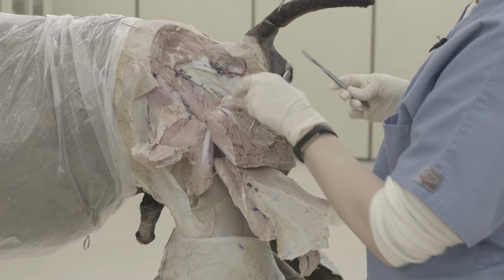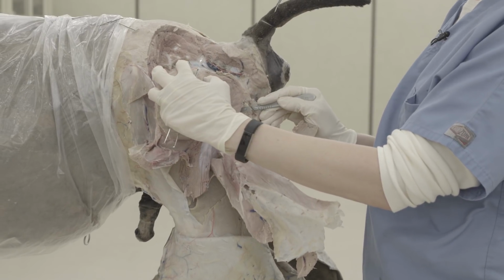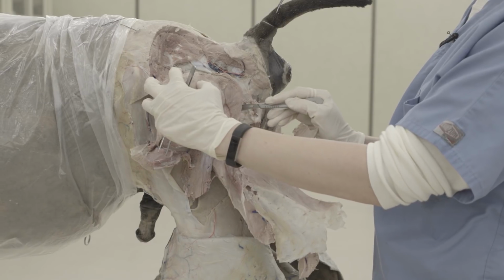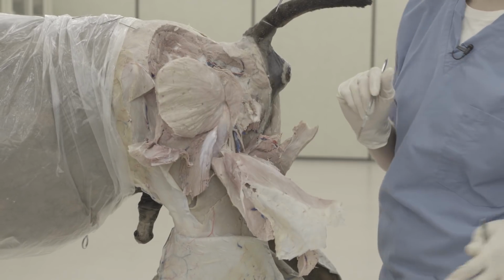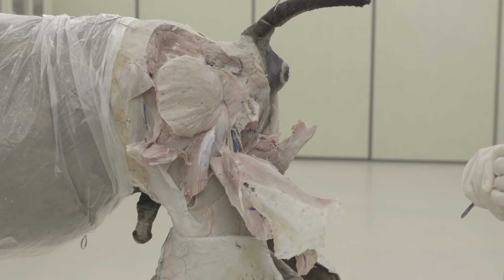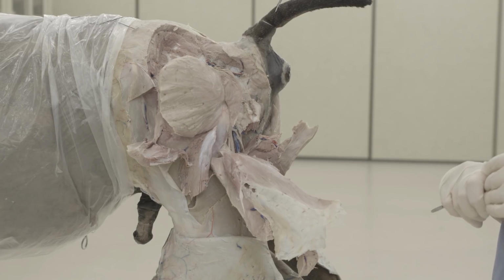Like that. You'll also have to cut through your internal obturator tendon that you worked so hard to find. That's back here. And then we have to put the pony on the floor into right lateral recumbency, and you'll need an assistant to help you lift the limb while you cut the leg.